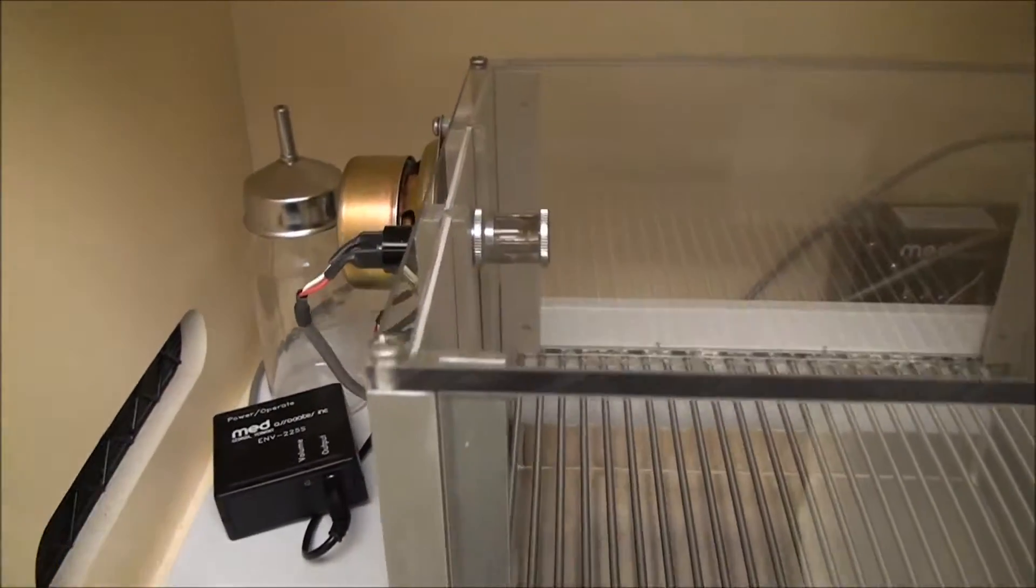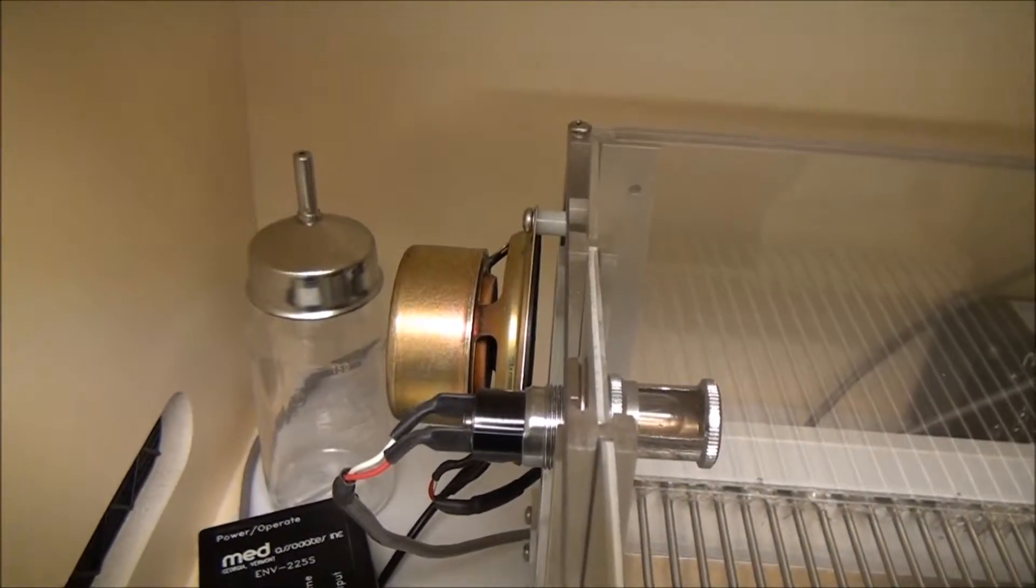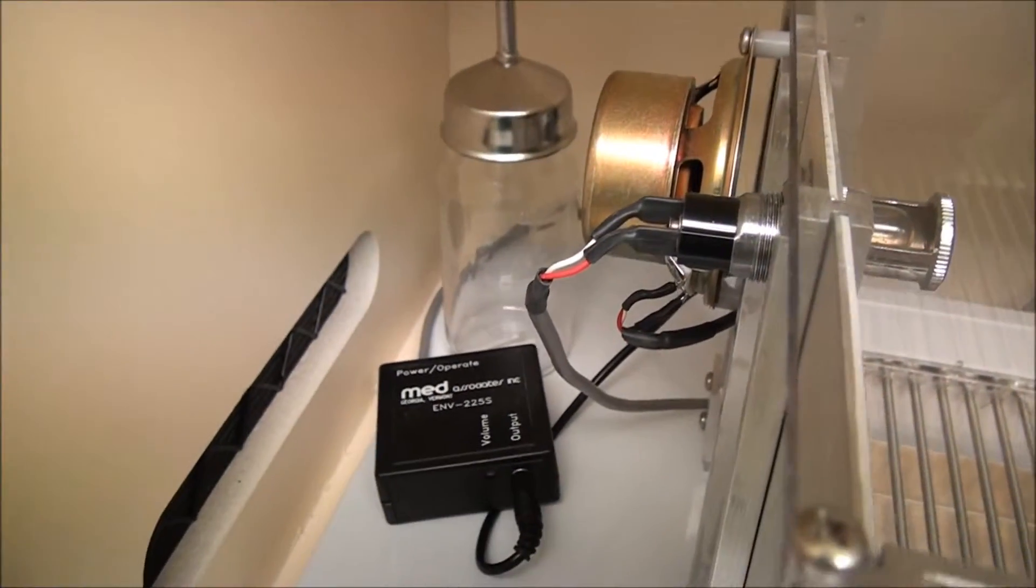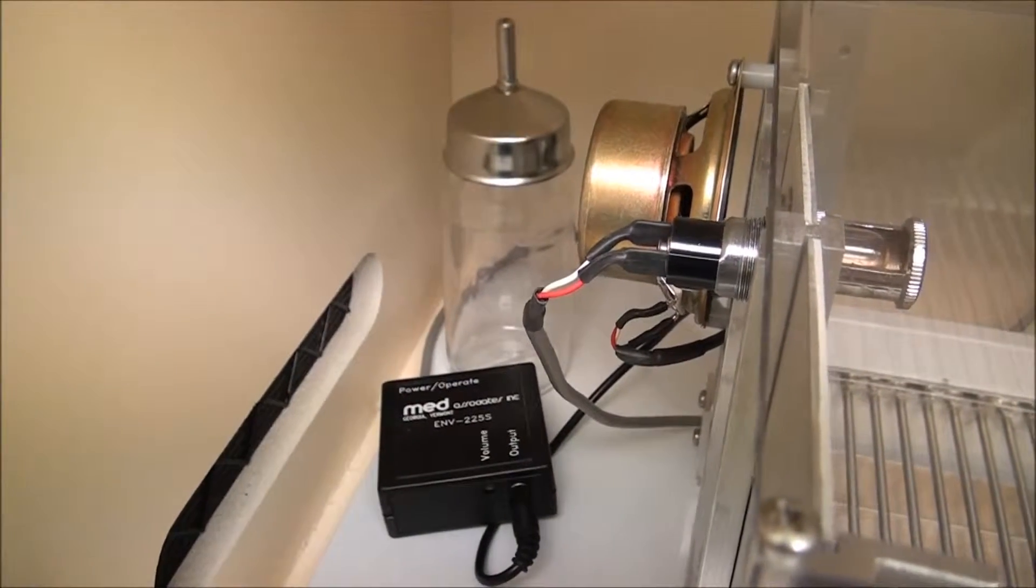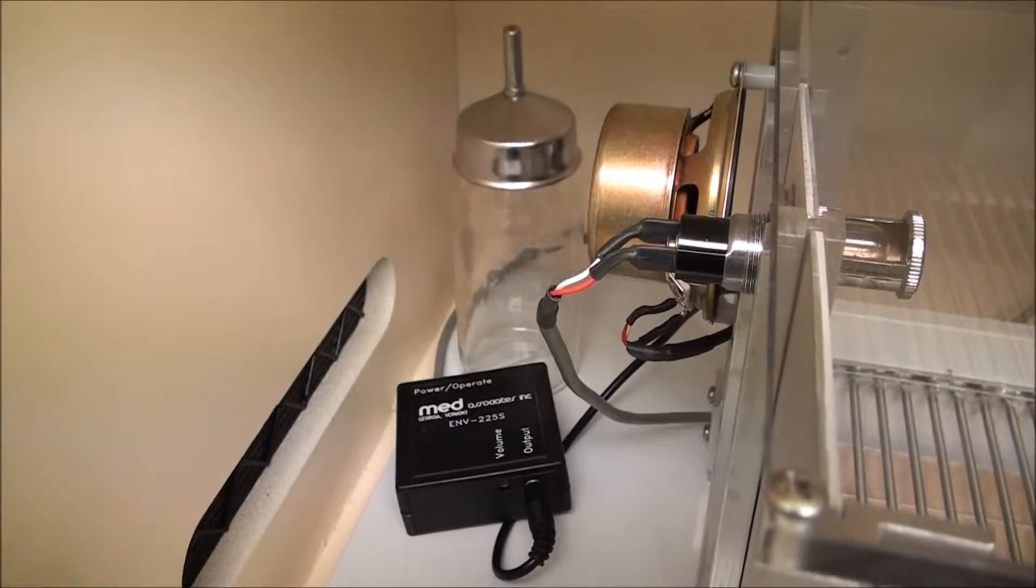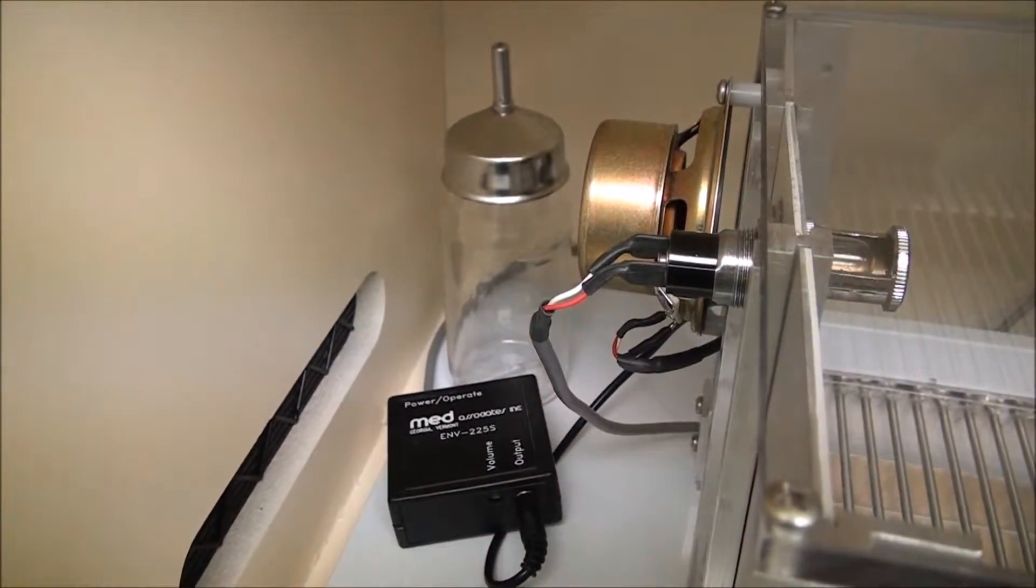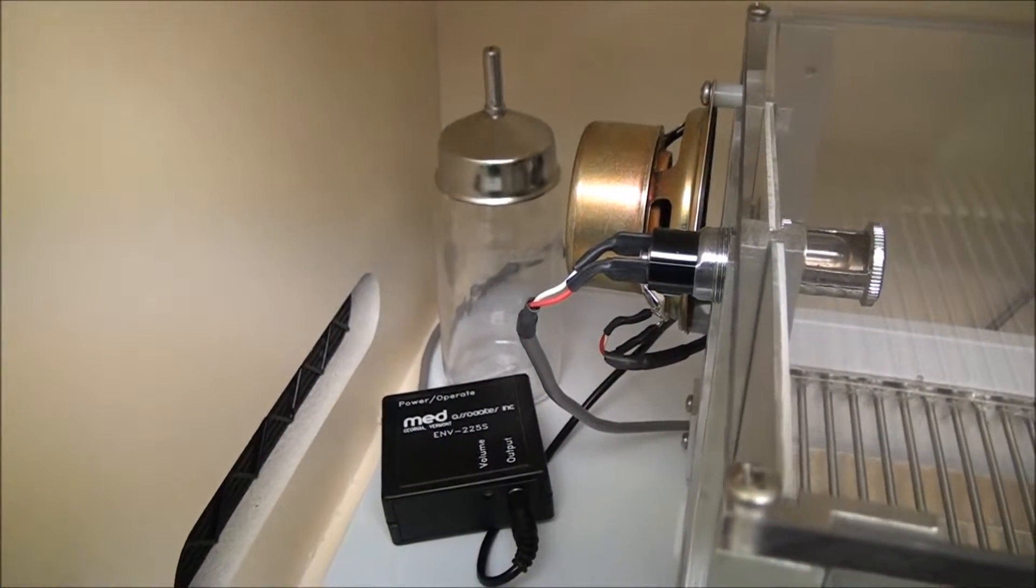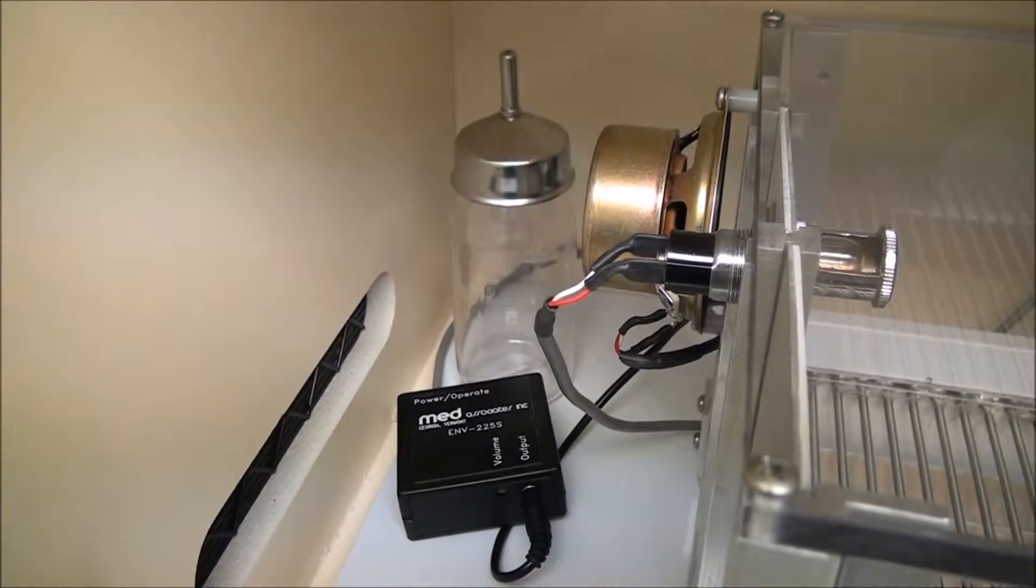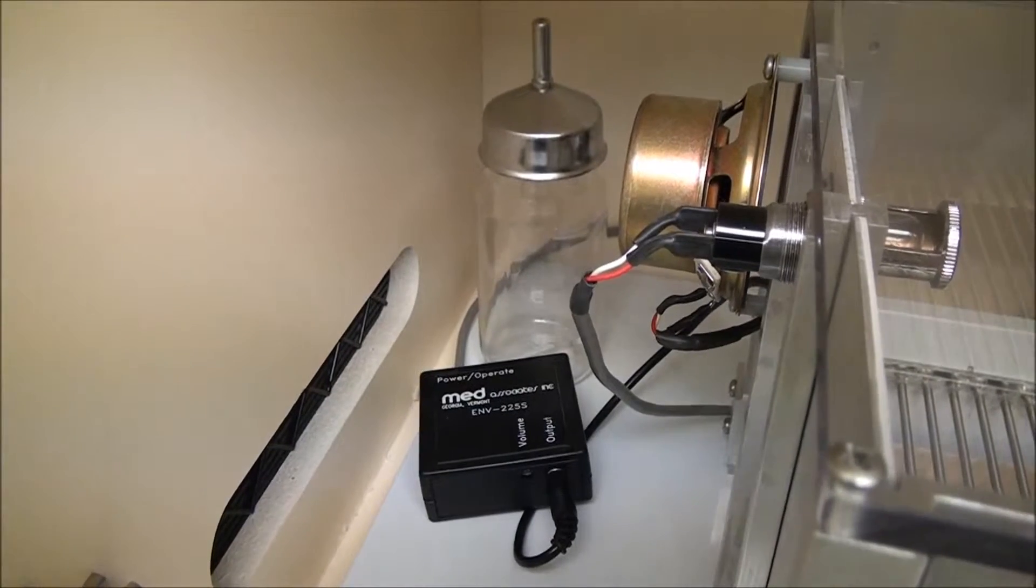And I'll start back here. You can see the speaker mounted back here on the back corner, and then there's also the controller for the speaker, and that's just one of the outputs for this chamber. And keep in mind that all chambers are identical, so as we show you these options on this chamber, every single option is the same on every chamber.